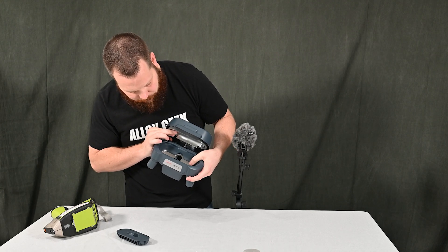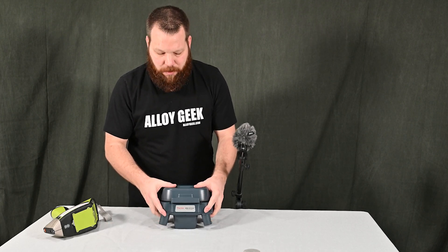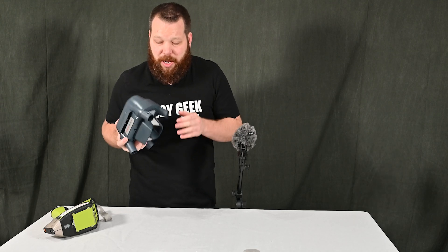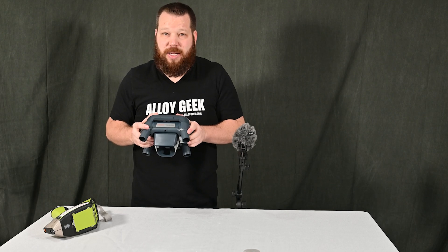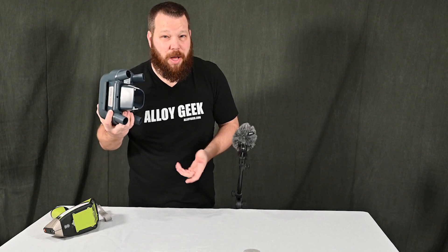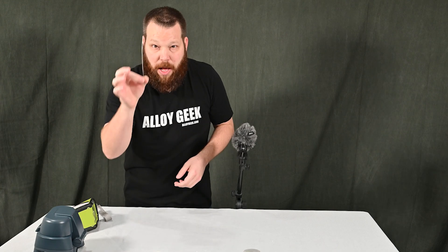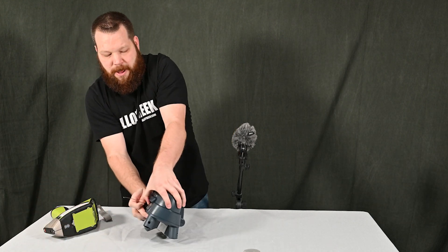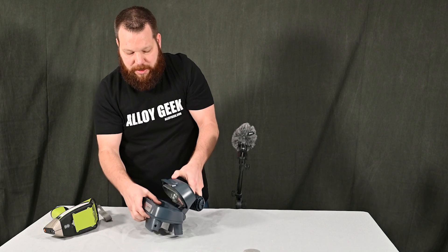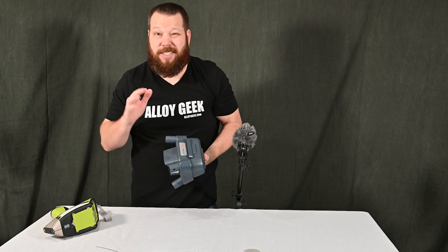Does it work? Yes. Is it ideal? I don't think so most of the time. You see these in a lot of jewelry shops, but you can get a much nicer test stand. Where this test stand is really beneficial is portability — you can put it in a case and carry it into the field. I see that in mud logging, geological applications, and mining. But even a piece of weld wire — typically a six-inch piece — doesn't even fit in there properly; it needs to sit flush on the bottom and it's not doing that.